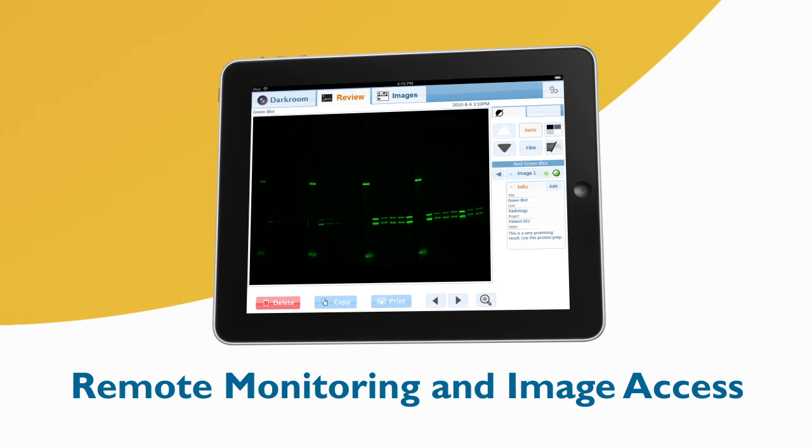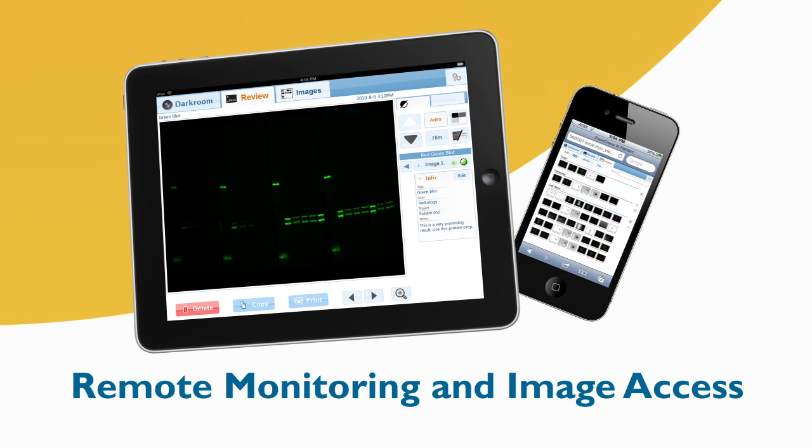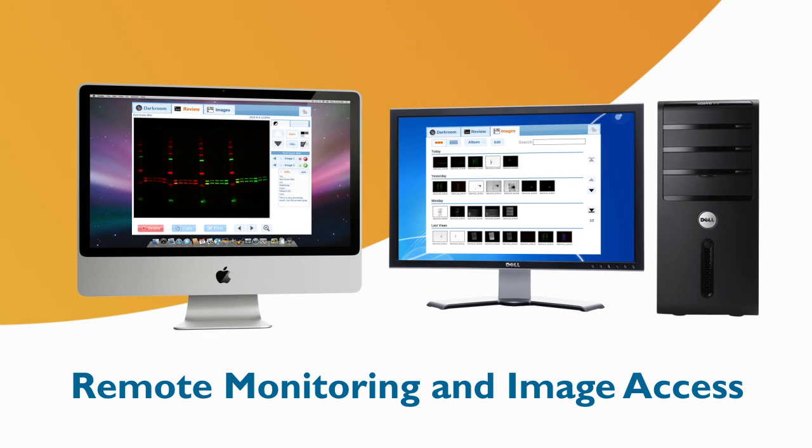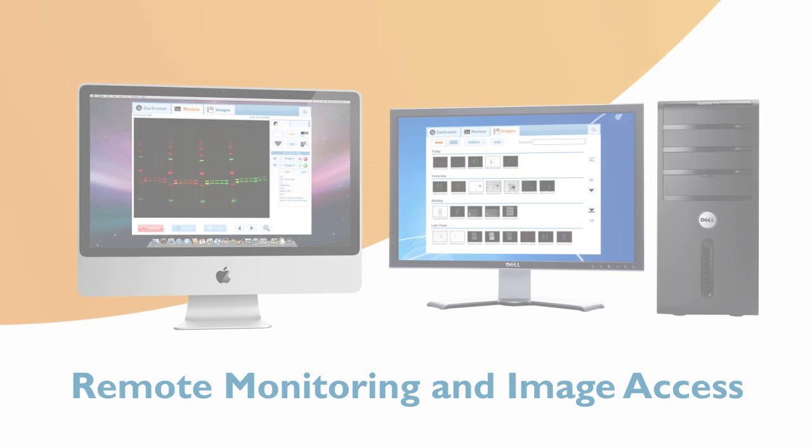Users can monitor acquisition's progress and access images on the FluorChem M from any networked Wi-Fi-enabled device or computer. Its unique browser-based remote interface simplifies image retrieval and is ideal for multi-lab environments.